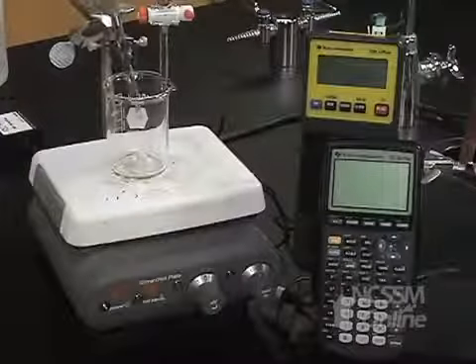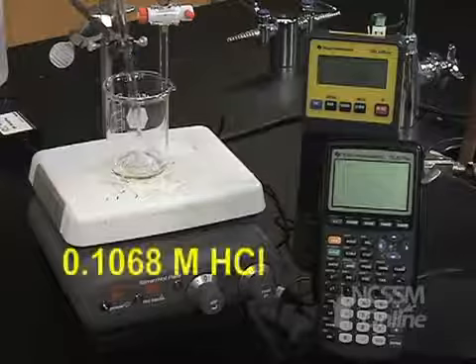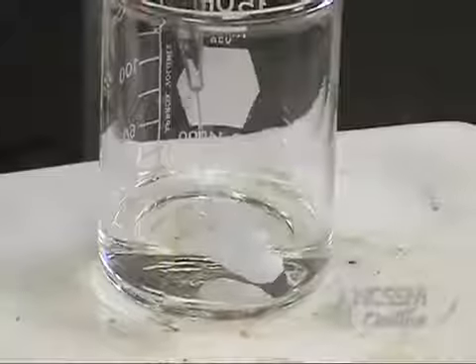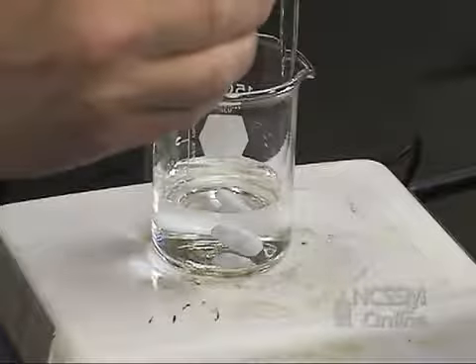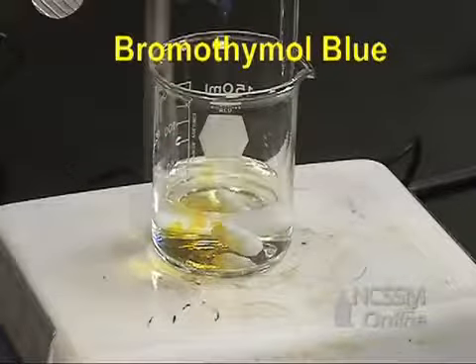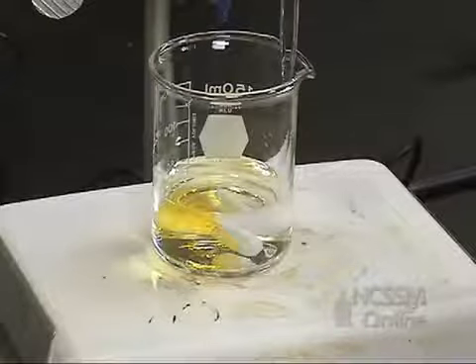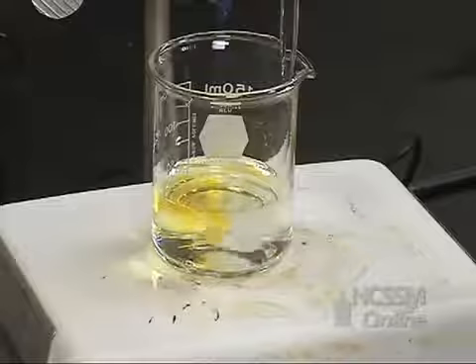The first titration will be a 0.1 molar solution of HCl with a 0.2 molar solution of sodium hydroxide. We're going to pipette 50.00 milliliters of an approximately 0.1 molar solution of HCl into the beaker. We're going to add 2 to 3 drops of bromethymol blue indicator. Bromethymol blue is yellow in acidic solution and blue in basic solution. It changes color at about a pH of 7.